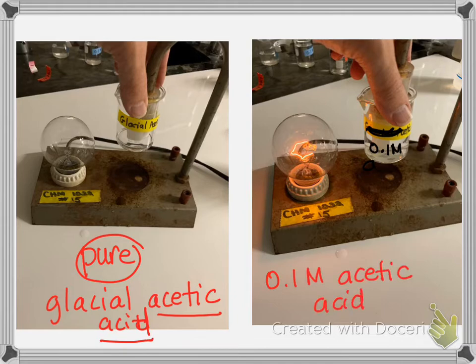And it's really, I think this is so cool. So look, when I make a mixture and I dilute it and add distilled water, so the water doesn't add any ions, now it creates ions. And this is an example where acetic acid, which is CH3COOH, I added water to it and it reacts. And it makes CH3COO with a negative and H3O plus.